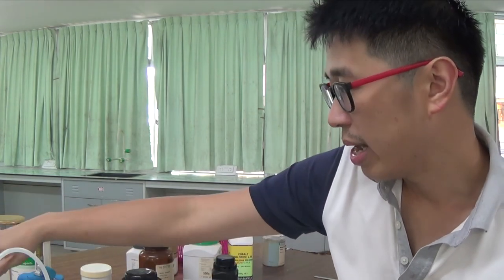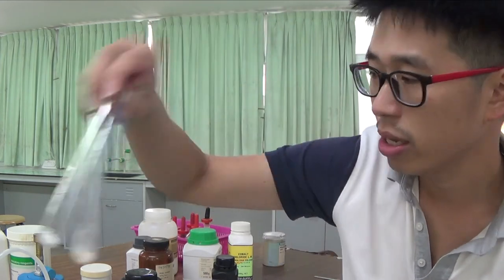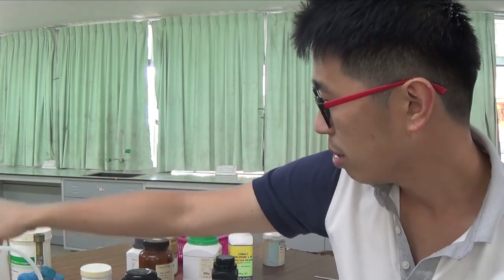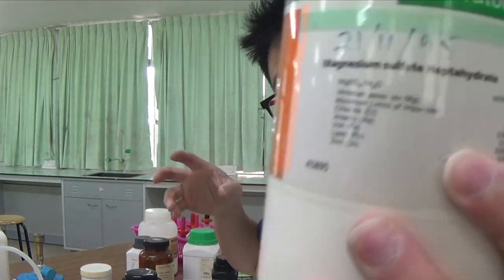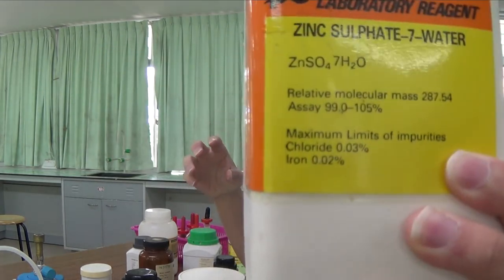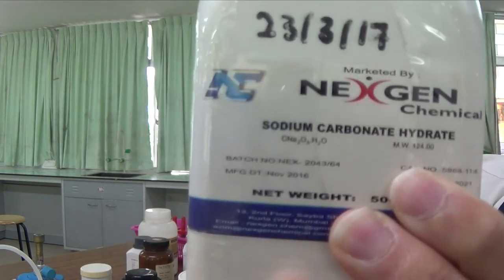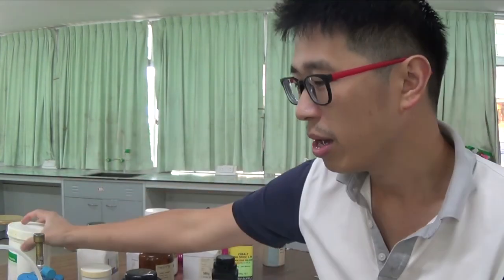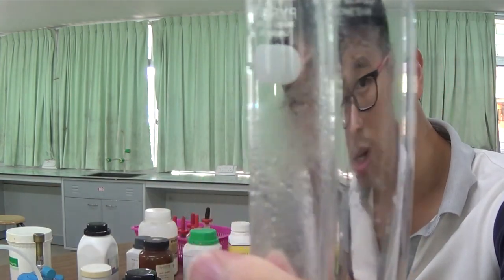What else can we say? We started out with the white colored solids: magnesium sulfate hydrated, this one. We also talked about zinc sulfate hydrated. We also talked about sodium carbonate hydrated. So those are white solids. When you heat them up, you get a colorless liquid forming on the upper part of the tube. You see the condensation.